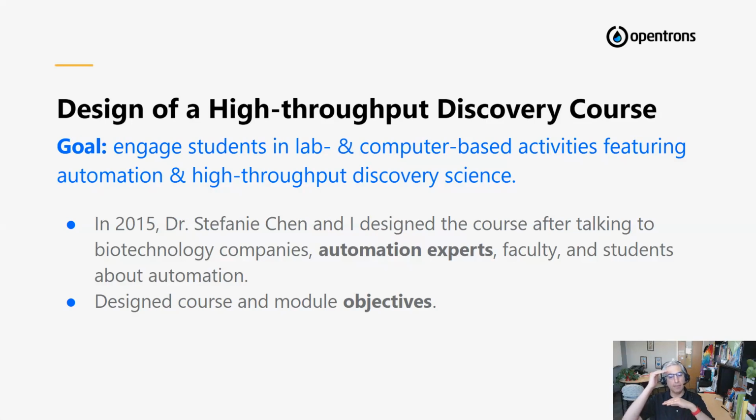So we had a set of 6 or 7 course objectives that we wanted all participants to meet. I should mention that this is a half semester lab-based course for undergraduate and graduate students from several different majors and programs throughout our campus. And we designed several modules, 7 modules, each addressing different questions. For example, the first module is, what is high throughput discovery? And module 2 is, what makes a good screen, where we talk about reproducibility, Z factors, and calculations.